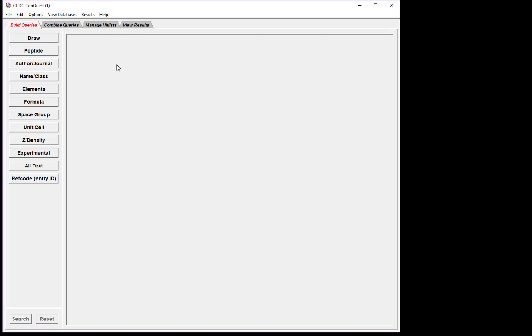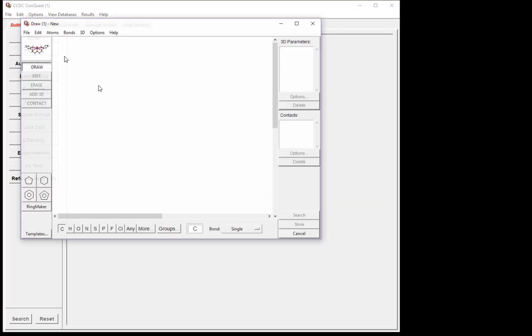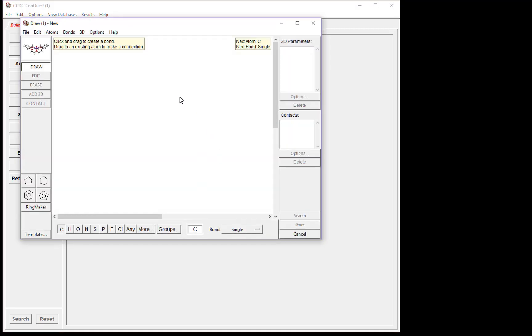To start the substructure search, click the Draw button. Here we have the Draw window. Across the bottom, we have atom types and bond types, and templates. Along the right-hand side of the window, we have 3D parameters and contacts, which we will add as part of the search.